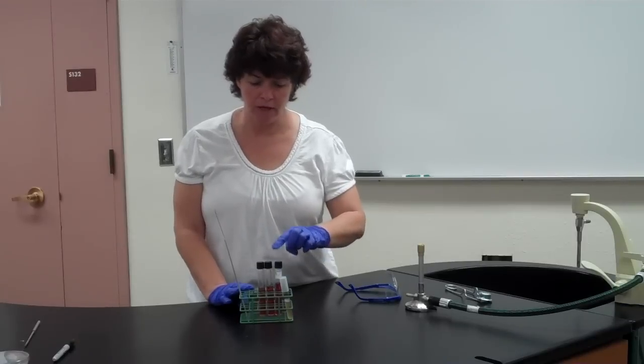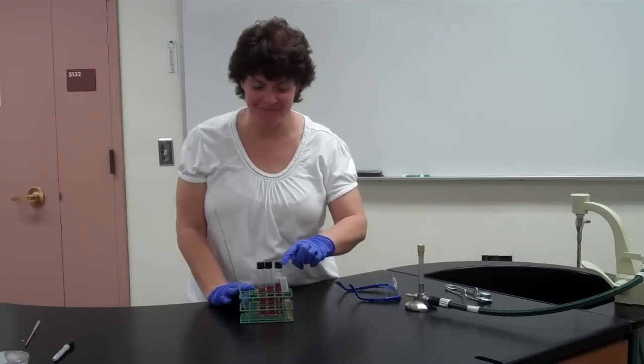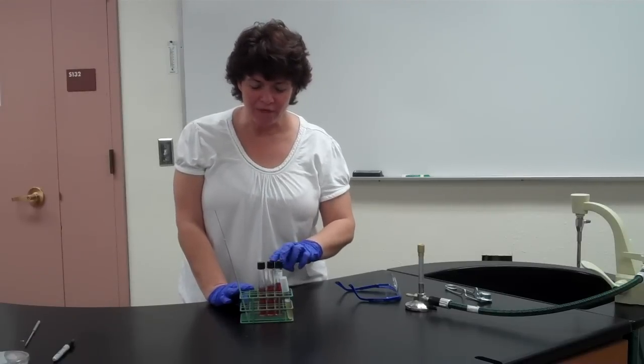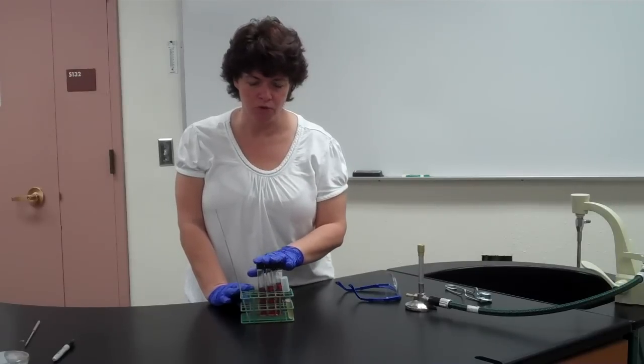So I'd put E. coli into all 3. And I'd put, what's the other ones we're using? I can't remember. Almost pretend staph into all 3. And one of them, the typhimurium one, we may or may not have gotten in. I think we did, so you'll probably end up with 12.